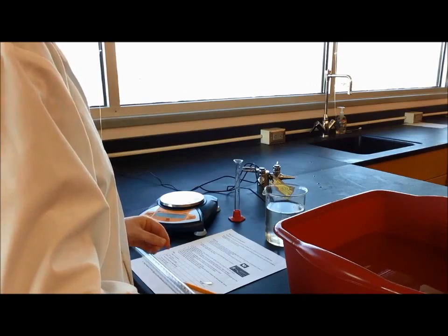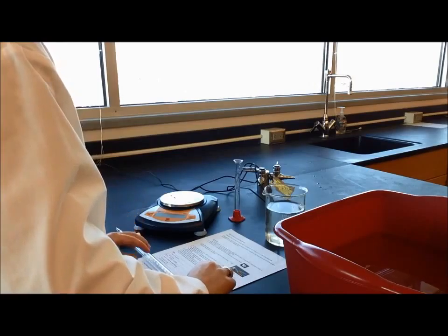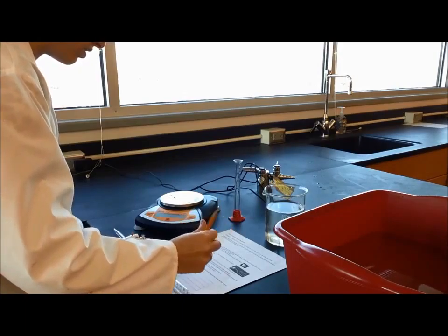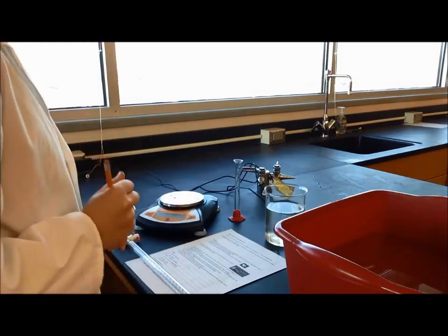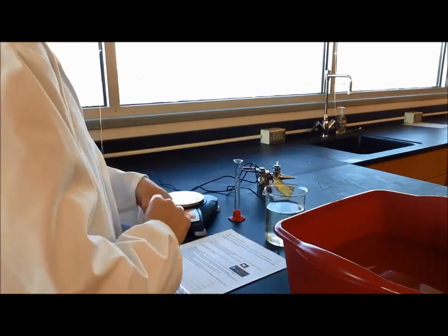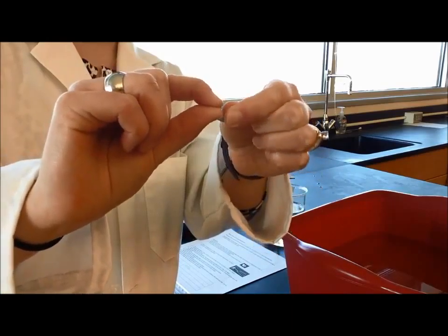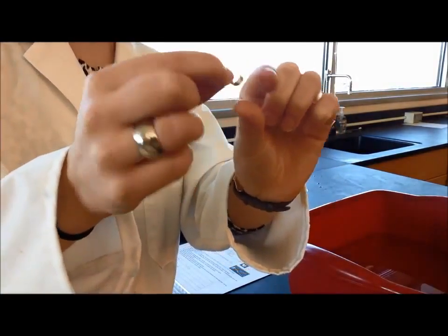Step two says mass the piece of magnesium and record below. The mass of my magnesium is 0.05 grams. I'll write that in my data table: 0.05 grams. Then it says fold the piece of magnesium but leave the surface exposed — just kind of in a loop, but not crumpled up, so all the sides are still exposed.